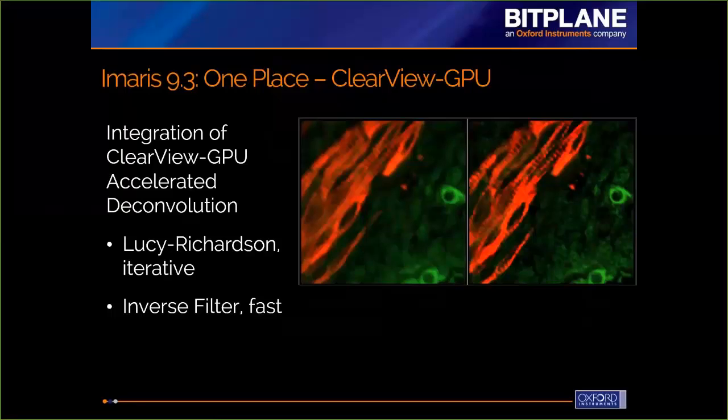This is a product that was developed at Andor, so that's our parent company. They have implemented it and have been using it within one of their products, the Dragonfly Confocal. They've been using it for quite a long time, so it's well thought out and it's been well vetted. For the iterative method, it uses a Lucy Richardson implementation, and the important thing is that they've made it very, very fast. And so you should notice that the speed is impressive within this. It is GPU accelerated. That's where we get the speed from.